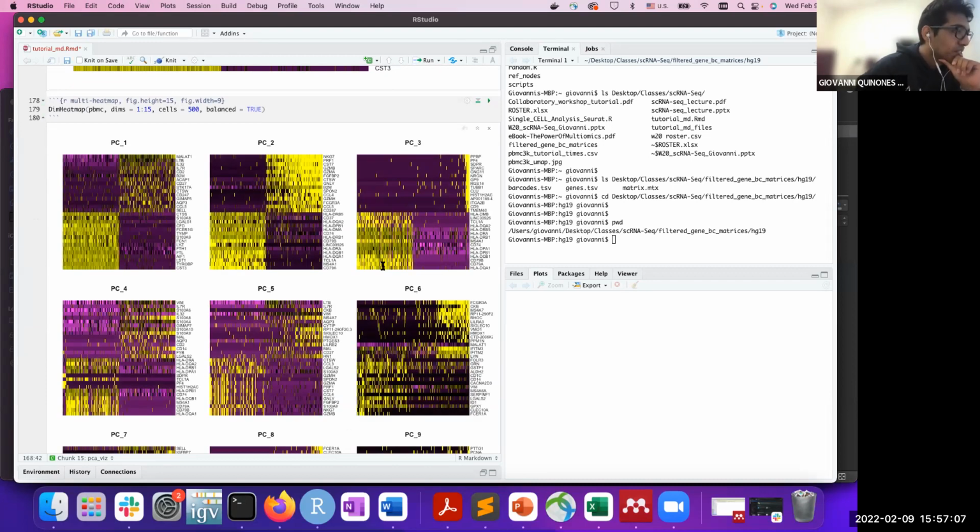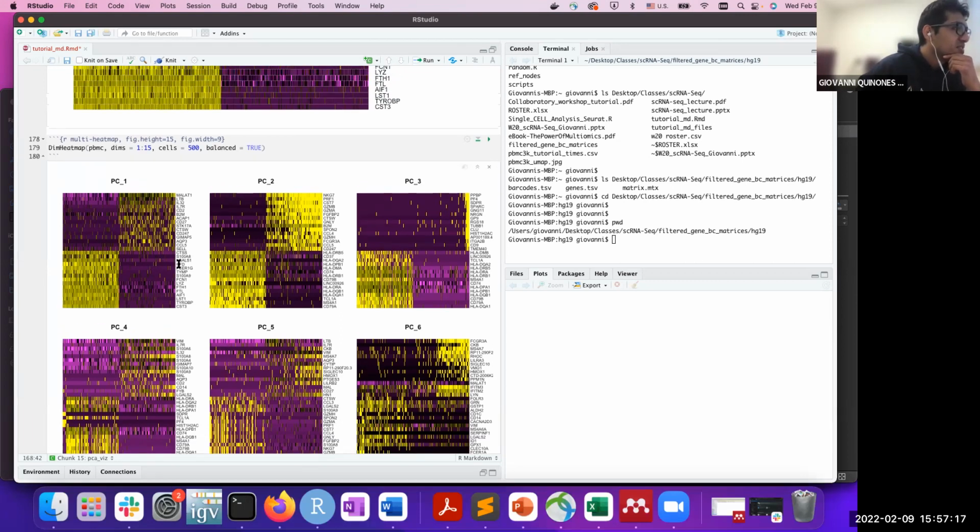Once you generate this plot, I want you to notice a trend that becomes very evident. We've seen this plot before with PC1, where I mentioned that the cluster looks very clear-cut. There is a very strong signal for a unique pattern among this set of genes.